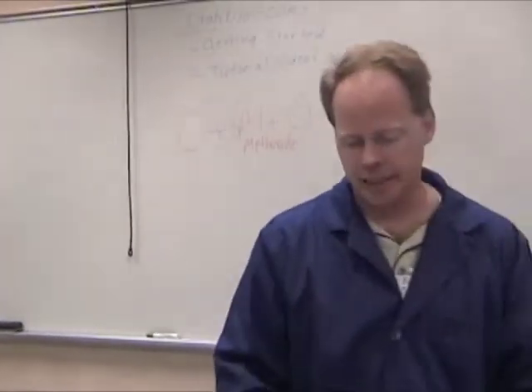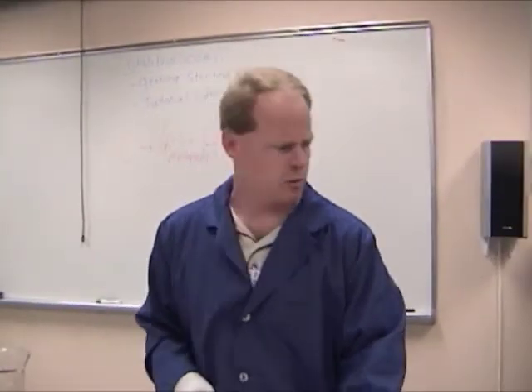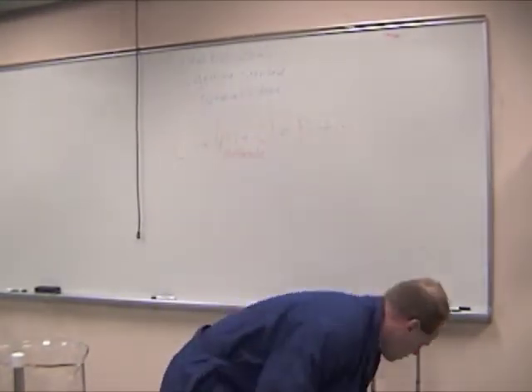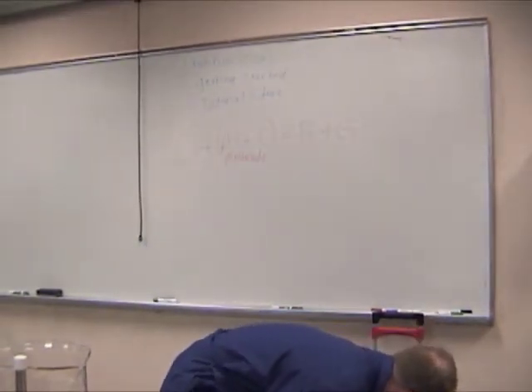Let's talk about titrations next. Oils. I need to run out and get you a mini stir bar. Alrighty. Where are my samples of waste oil? Okay, this is WDO? Yeah. Okay. And I don't know which one is the heavy duty and which one is not. So we'll find out which one is and which one isn't.